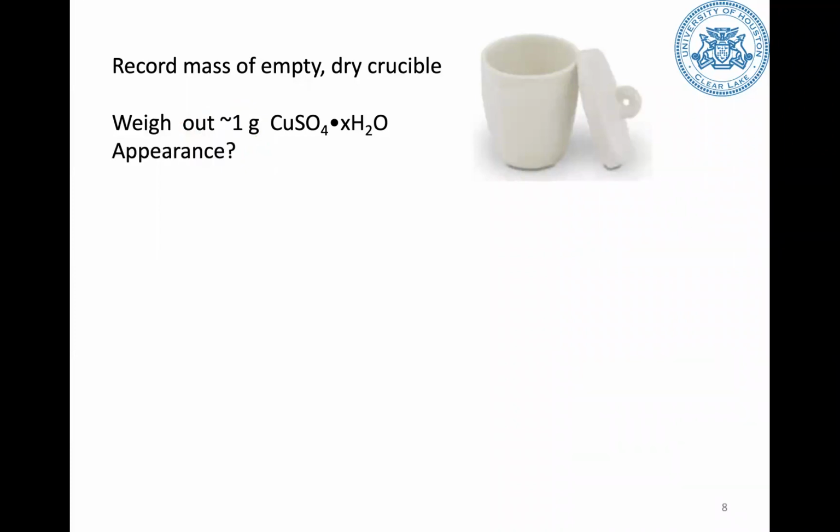So you need to record or observe the appearance. The appearance will include either color or shape. For the shape, you can see whether it is a crystal or not. And if it is a crystal, you can see whether it is a needle or flare or flake, some different form, and you can describe that. So these are what we call appearance.